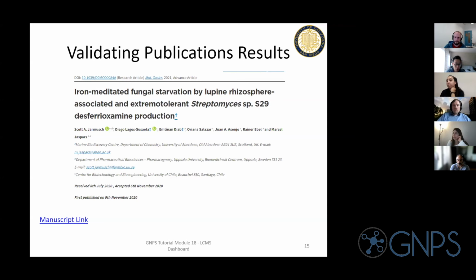There is another one from Thomas: cache the raw files. Yes, so we preload and cache the raw files. Tomasz has a history of developing software, so he thinks in this way. The very first time you load a file, we have to get the file, and so we cache not only the mzML or mzXML or .raw file, but we also reconvert it just in case we need to.